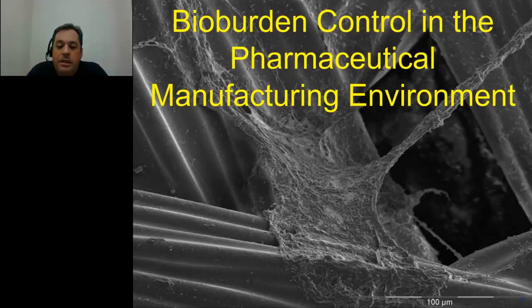And what you can see is actually a biofilm growing kind of right out in space, clinging to multiple of these spacer fibers. So a lot of times we think about biofilms as being surface associated, but sometimes they can be very much three-dimensionally into your fluid path.